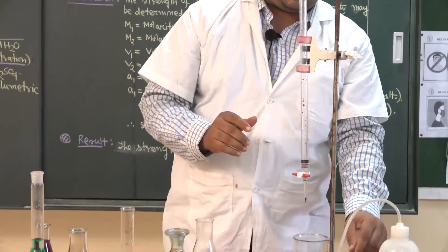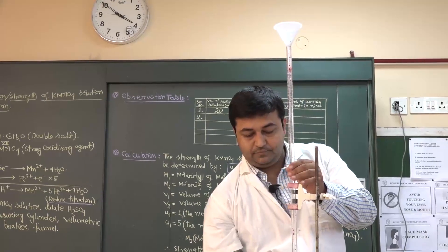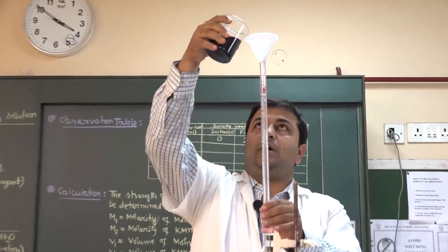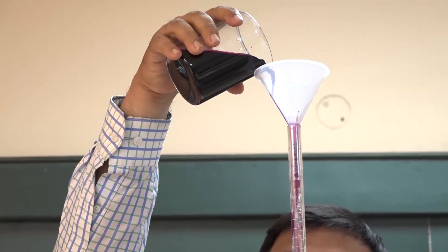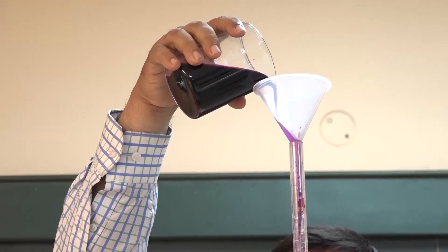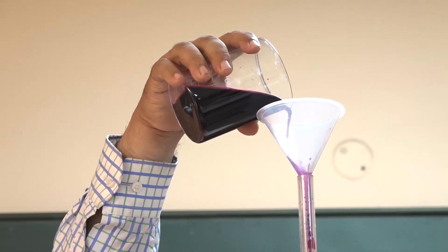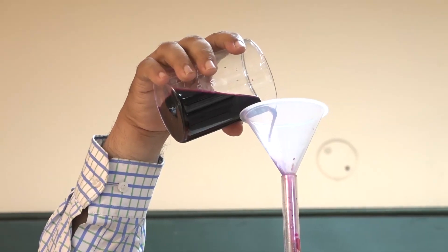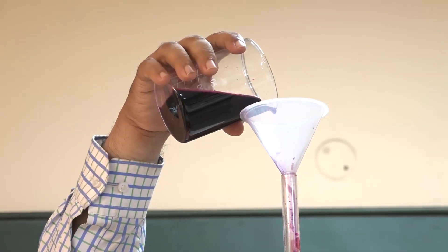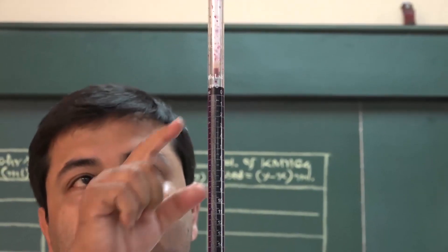Now I will fill the burette with potassium permanganate solution. I will take the solution up to the initial reading, which is the zero mark. Student, you can see this is the zero mark — the initial reading.